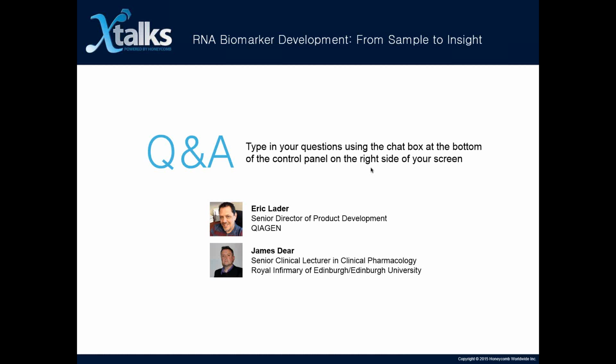Great, thank you so much to the both of you. Our next question is for Dr. Lader. For exploratory studies, does QIAGEN have arrays available for unbiased microRNA profiling rather than the smaller pre-selected targeted panels?